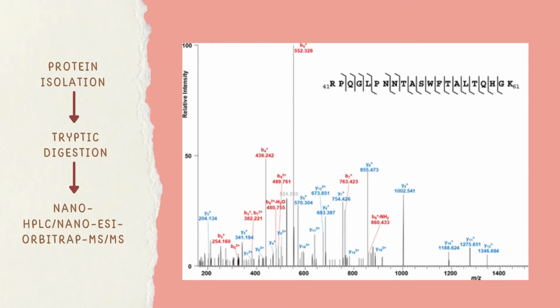It was estimated that the viral load of the two positive solutions were around 100,000 to 1,000,000 genome equivalents per microliter, whereas the negative solution was only around 1,000 genome equivalents per microliter. The peptide sequence shown in the figure originated from the SARS-CoV-2 nucleoprotein that was determined using ESI-MS methods.